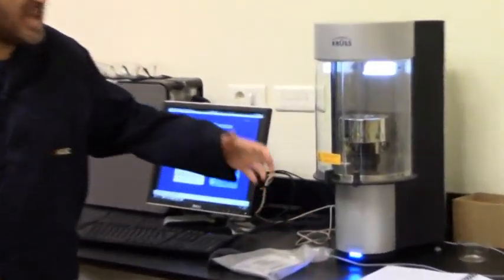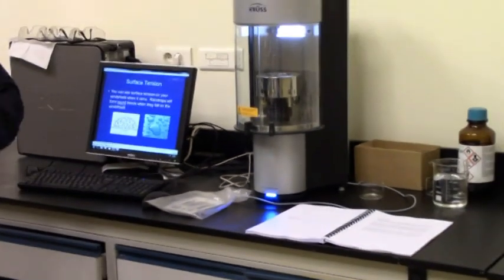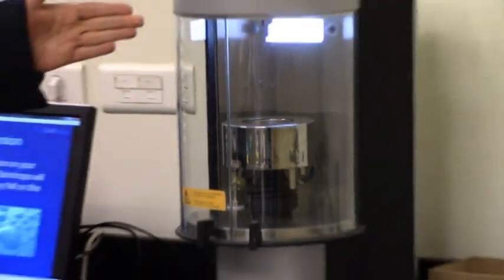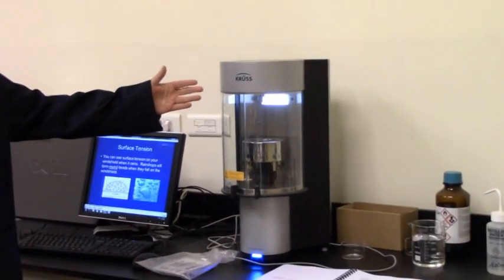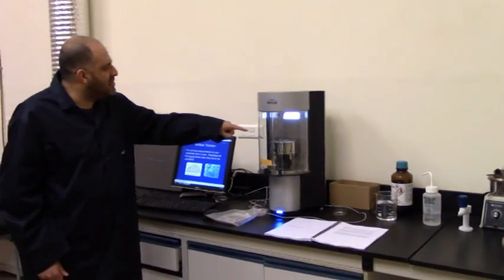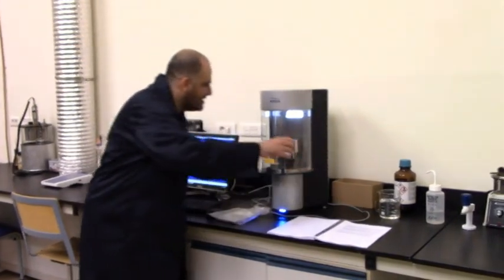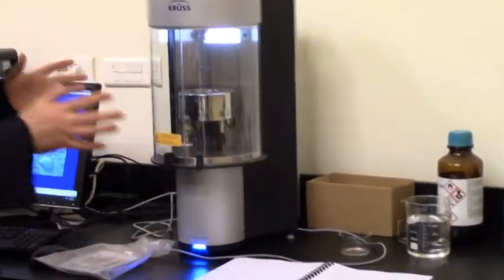This is a type of device that has upper parts like a sensitive balance, where it measures the forces that we have at the metallic part, or the solid part, hanging up here, together with its interaction with the liquid phase that will be put in such a vessel on this platform. This is one way of measuring contact angle.